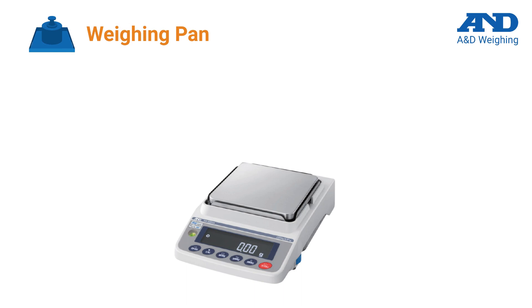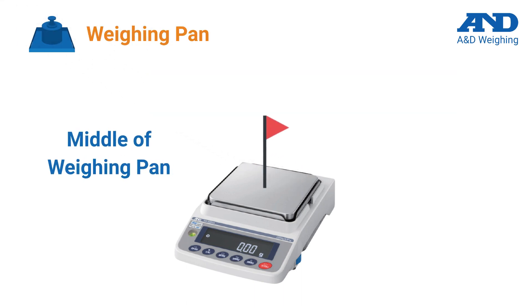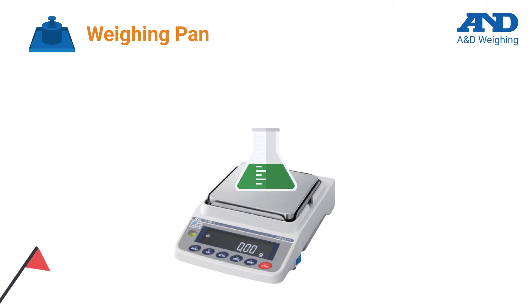Samples and weighing vessels should be placed in the middle of the weighing pan to prevent corner load errors. We minimize this chance for error with our high-quality engineered pan design.